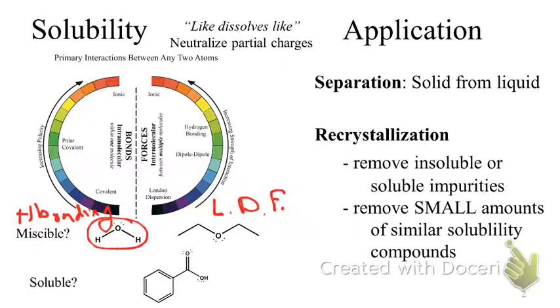Okay? So based on these two, would I expect those two substances to mix? Should water mix with diethyl ether? Or should it be miscible? What do you think? Solubility was based on the rule like forces dissolves like forces. Is a hydrogen bonding interaction similar to London dispersion interaction? Okay, partial solubility, but we're getting fairly disparate as far as those types. So we're going to expect a fairly low solubility. We might expect to see some, but not a lot.